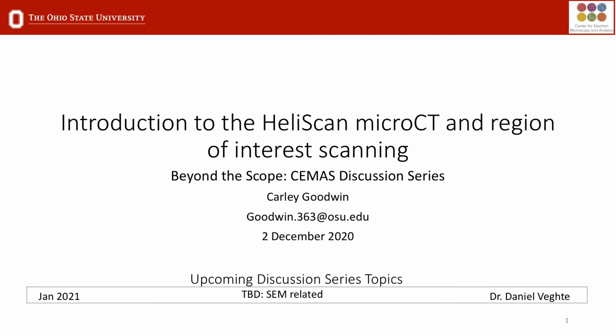Thanks for the introduction, Dan. And thanks also to you and Ashley Albertson for organising and hosting the discussion series this year. Good afternoon, everyone. Thank you for taking the time to join me today. My talk is titled Introduction to the HeliScan microCT and Region of Interest Scanning. I am Carley Goodwin, and I'm a research associate here at the Centre for Electron Microscopy and Analysis, and I manage our HeliScan microCT system.